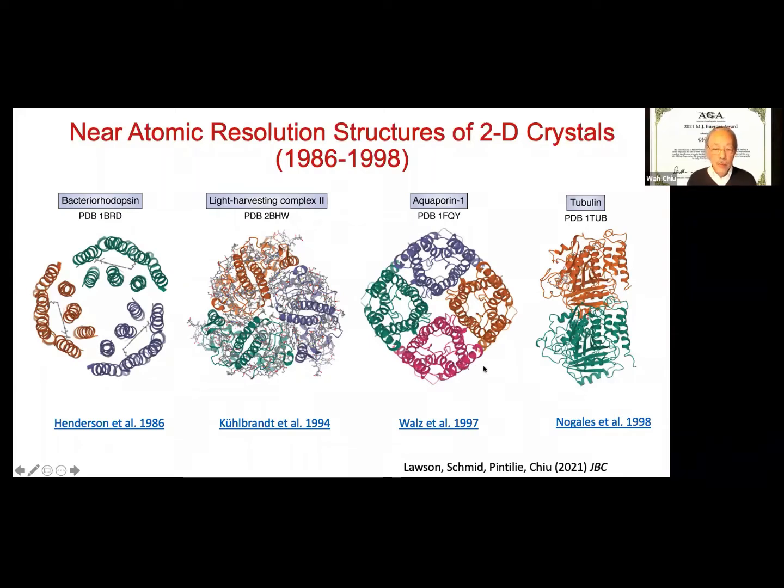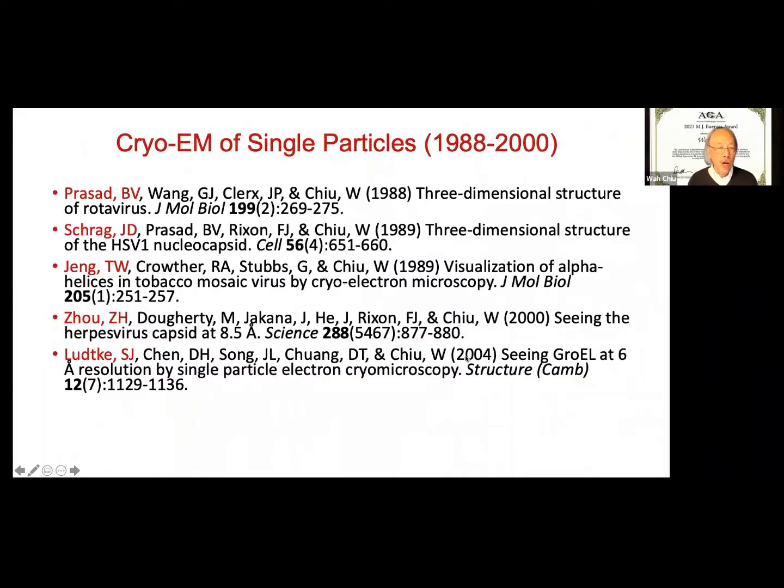Since that work, I was inspired by the work of Jacques Dubochet, who improved the method of Ken Taylor and Bob Glaeser in freezing the specimen in a more efficient cryogen, namely liquid ethane, which is the coolant that we use.